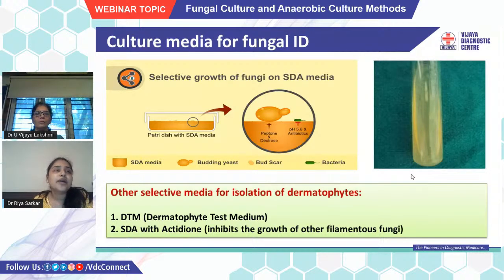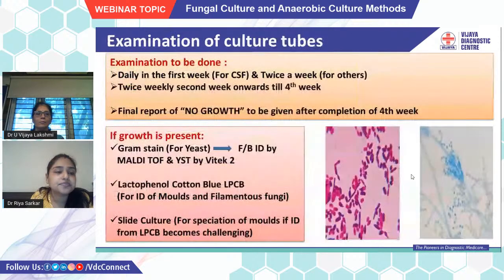For isolation of dermatophytes, we have two specific medias: dermatophyte test medium, DTM, and SDA with actidione or cycloheximide. The function of actidione is to inhibit the growth of filamentous fungi and propagate the growth of dermatophytes.